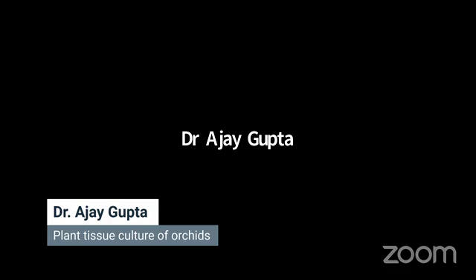Now, because only the shoot cannot grow or be transferred to the land, we have to initiate rooting in those plants, and that is called root induction. Then we prepare another kind of media where these shoots are transferred for rooting, and roots are developed. They again take around 2 months, around 8 weeks. Once the roots are developed, the plant is ready inside the flask, but still not outside in the environment.